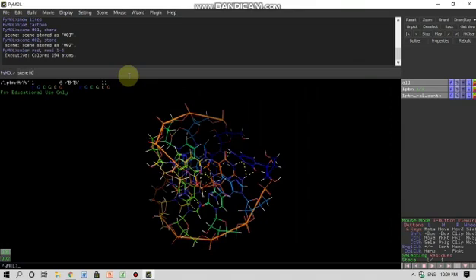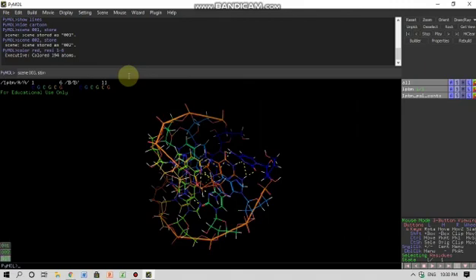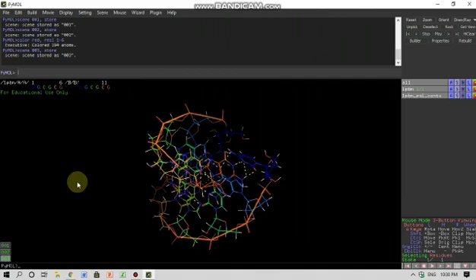So till now we have discussed the installation of this software and then the interface description and things about PyMOL.